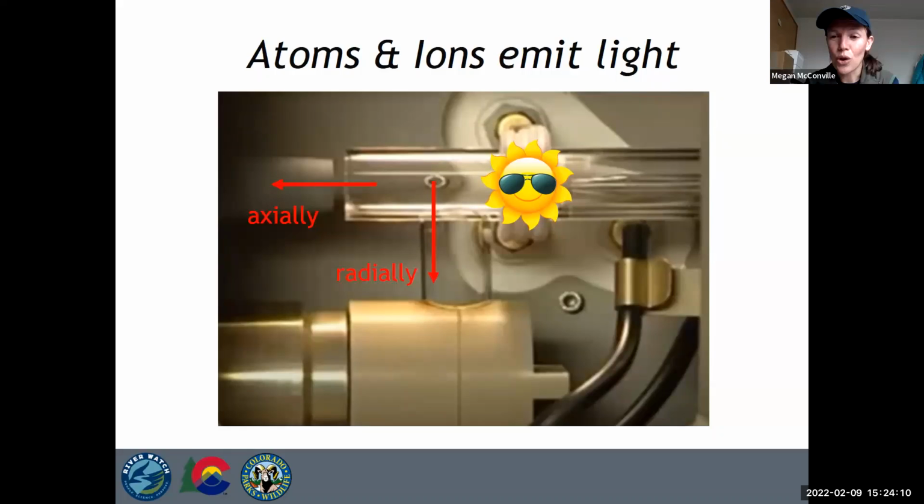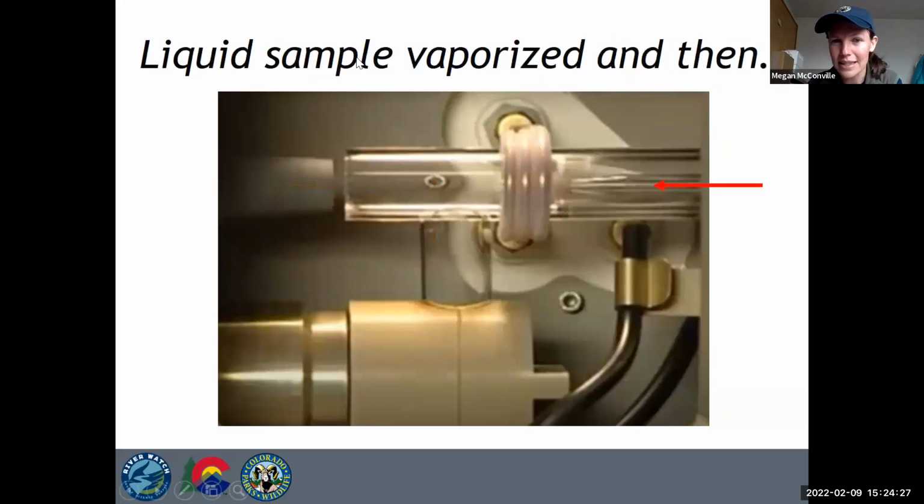Like so hot, right? Bradley's eyes are getting really, really big. There is some modulation that happens, but we are using a gas to create this plasma source. And we're using electromagnetic radiation. So around this radio frequency coil, we are moving energy so quickly, and gas molecules are attracted and start moving and colliding. And this creates this plasma gas.